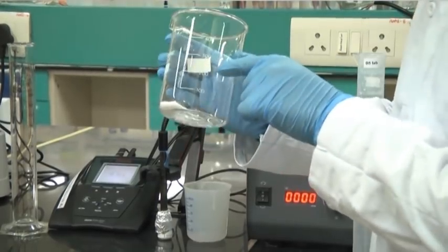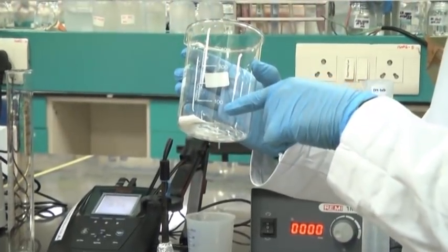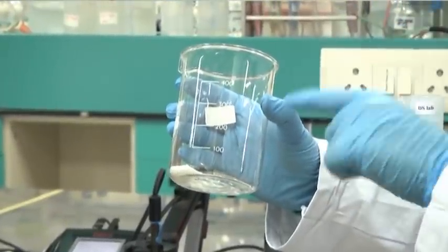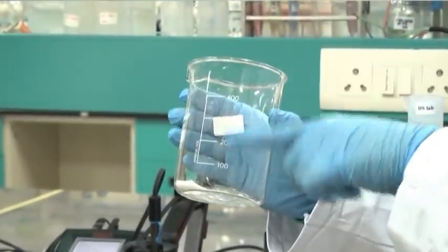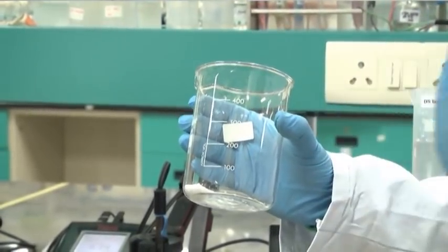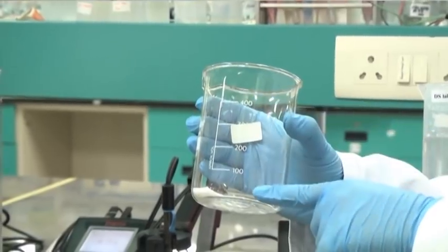Here we can see the graduation is marked around 100, 200, 300, and 400. However, note that the graduation in case of a beaker is not actually accurate — the graduation is a rough graduation. Never go by the graduation mentioned in a beaker.